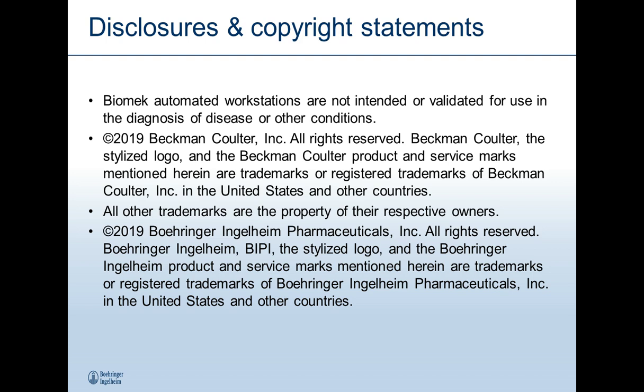If you develop your assay method at the bench manually, and you know that your assay is performing as expected, and then moving that over to a liquid handling platform or an integrated platform you start to see discrepancies or drift, it's not the chemistry or the biology of the assay that's your problem.